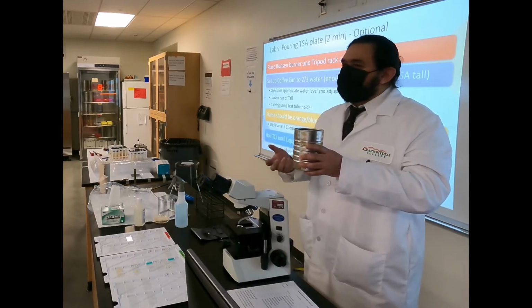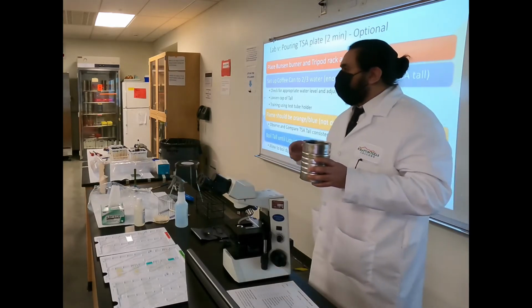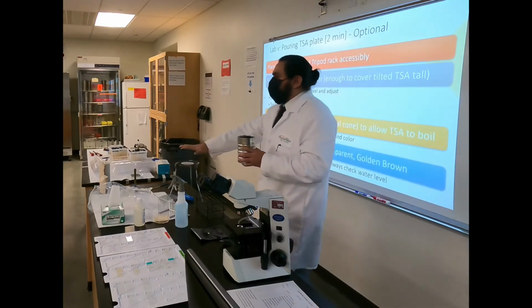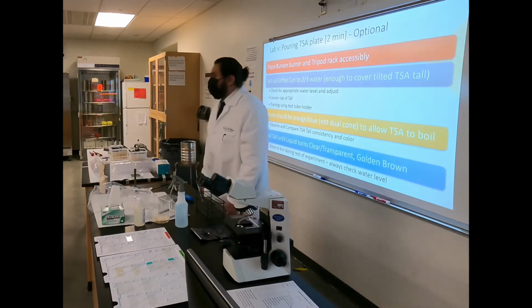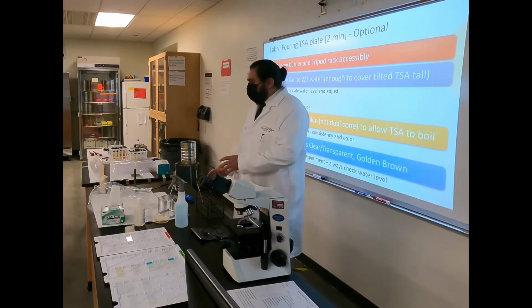I don't want students that start jumping over their benches or stepping over stools and accidentally causing destruction and spilling water, etc. So place this close enough that you can actually observe it without ever having to do this over a boiling can of water. All right? So make sure that it's placed correctly.